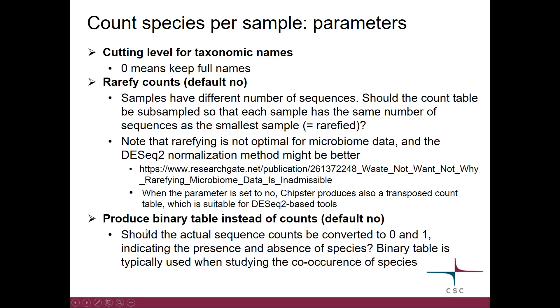You can also select if you want to produce a binary table instead of a count table — the default is no. A binary table means that if a certain species is detected, the table says one, and if it's not detected, the table says zero. This kind of binary table is typically used when studying co-occurrence of species.